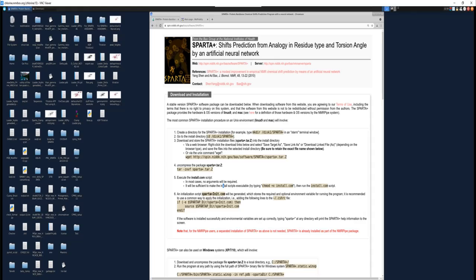In part 1 and 2, we had covered how to assign your protein using triple resonance experiments and NOESYs, along with strip plots. In this video, we are going to cover additional tools that can assist with the assignment process, and what to do after you are done assigning your protein. The first tool we are going to discuss is SPARTA+.